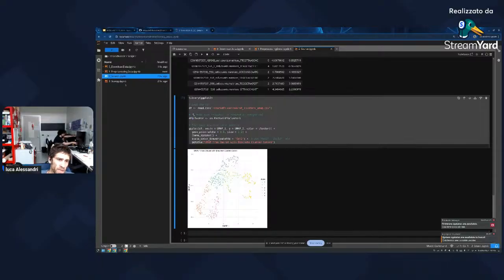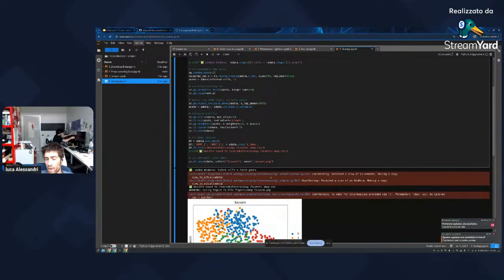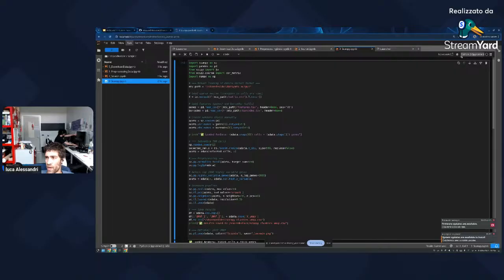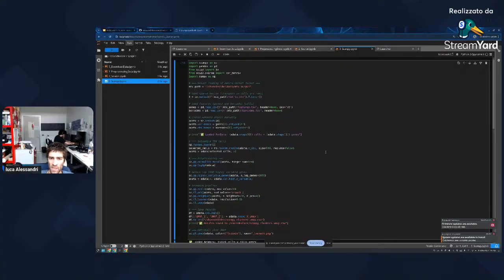But you also can give it a try to Scanpy. So if you don't find what you expect, well, then you can find Scanpy. So Scanpy is in Python. And as you can see, with Jupyter Lab, I can actually run everything either in Python or in R. Just be aware that whenever you choose a notebook, you have to choose either the Python or the R one. And over here, you have Python 3, for example. Instead here, you have R. So it tells you which is the kernel that is using.